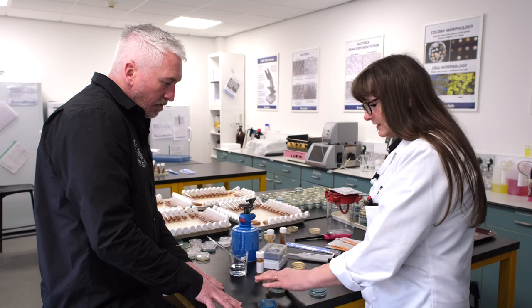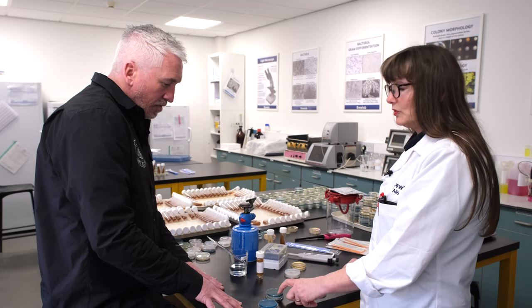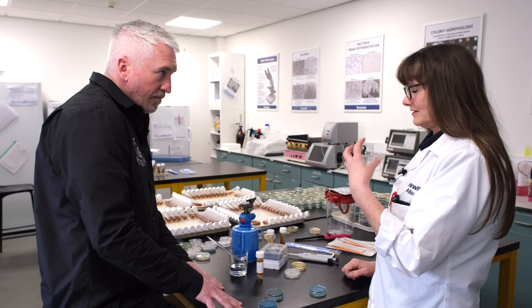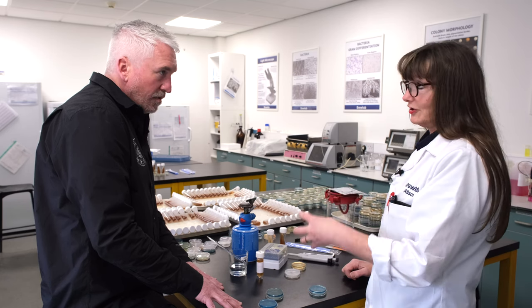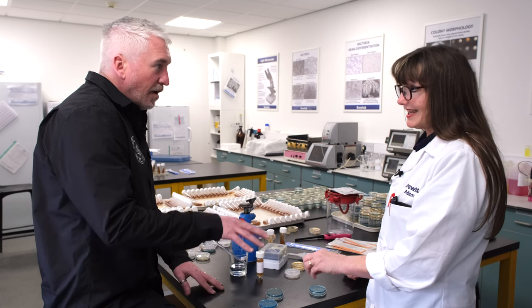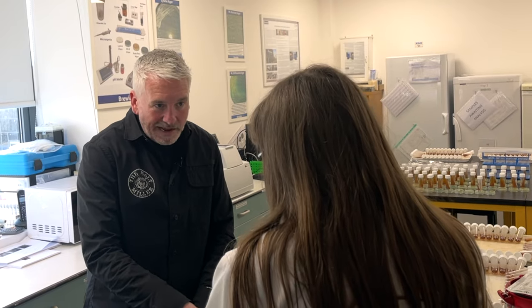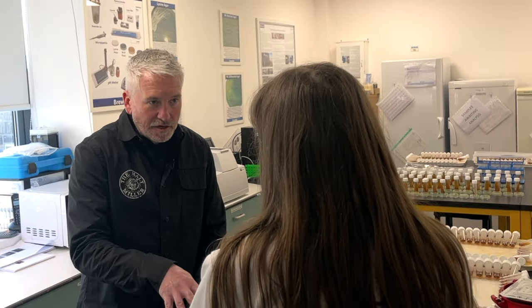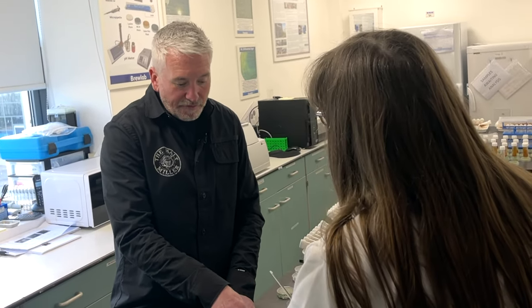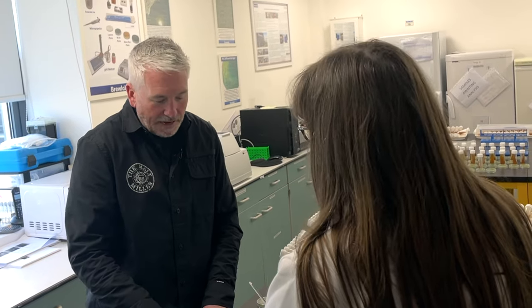Alongside that we have a yeast and mould plus copper plate. We add copper to it, which makes it so only copper-tolerant things can grow - which tends to be wild type yeast, especially diastatic yeast. That plate inhibits the growth of beer yeast but will allow nasty, copper-tolerant wild type yeast to grow. So the theory is: if anything grows on this plate at all, there's something wrong.